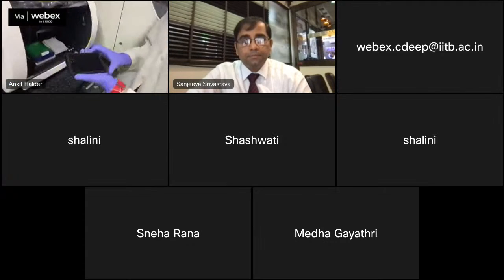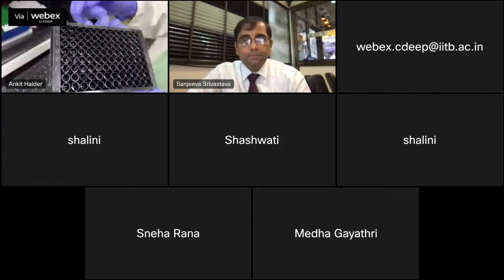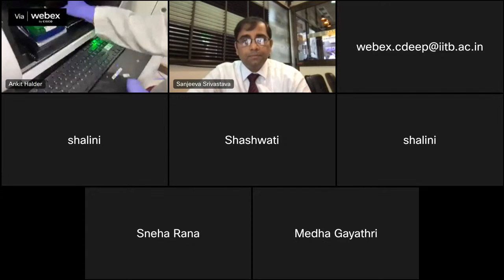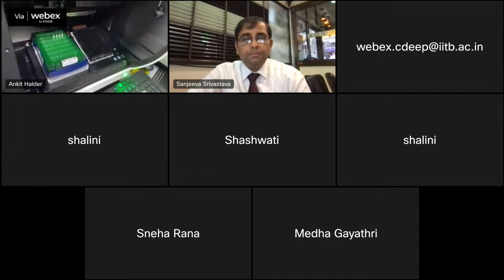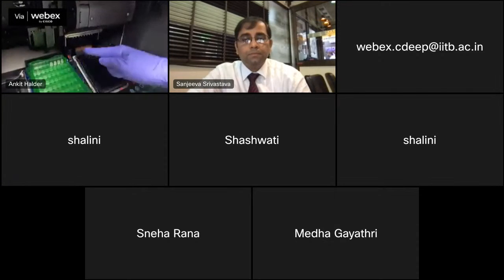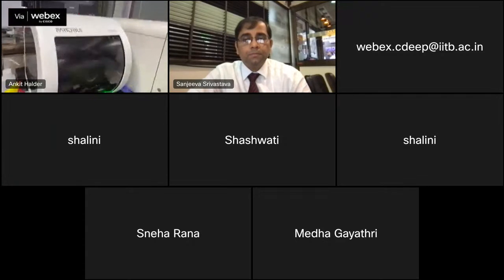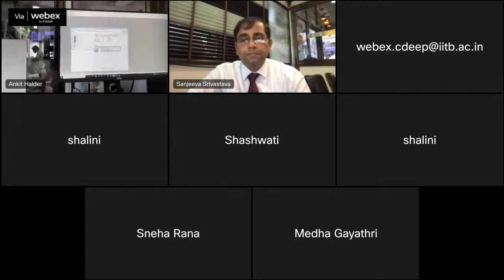Here is the second plate where we have added the buffers and samples, and this is the regeneration part where we add the regeneration buffer, hydration buffer, and equilibration buffer. We place it in such a way that these are properly set, and then we close it. Here you see the panel which picks up the sensors and then moves them into the sample measurements.